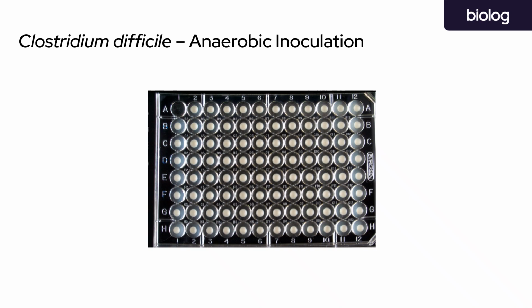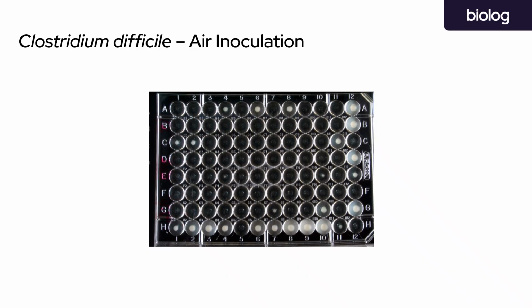Here's another example, this time with C. diff, an obligate anaerobe, which grew very well inoculated and incubated inside the anaerobic chamber. However, just a few minutes of oxygen exposure during the inoculation step caused an incredibly significant drop in viability. These unstable results have the potential to confound drug sensitivity results or metabolism studies, leading to inaccurate conclusions.